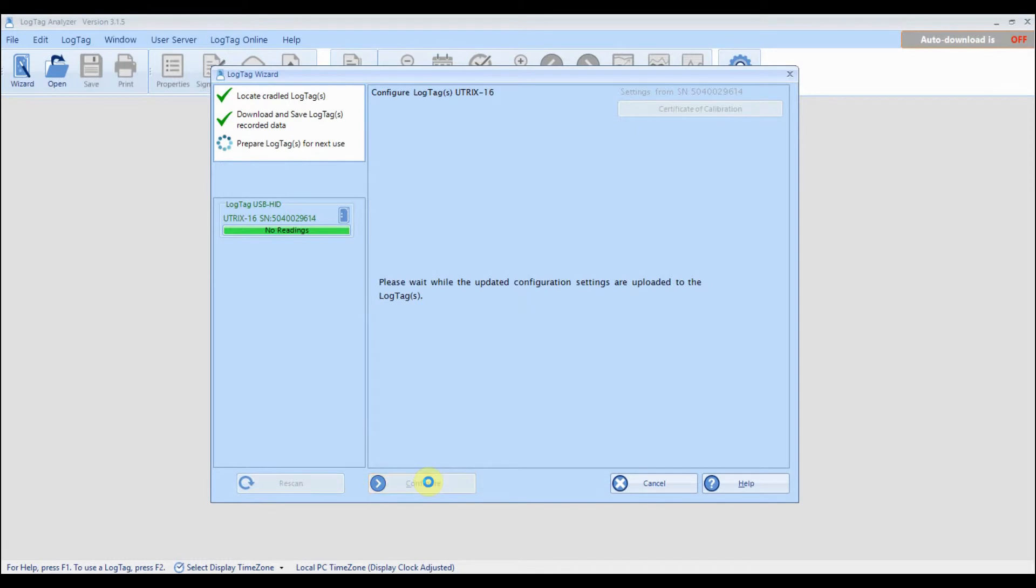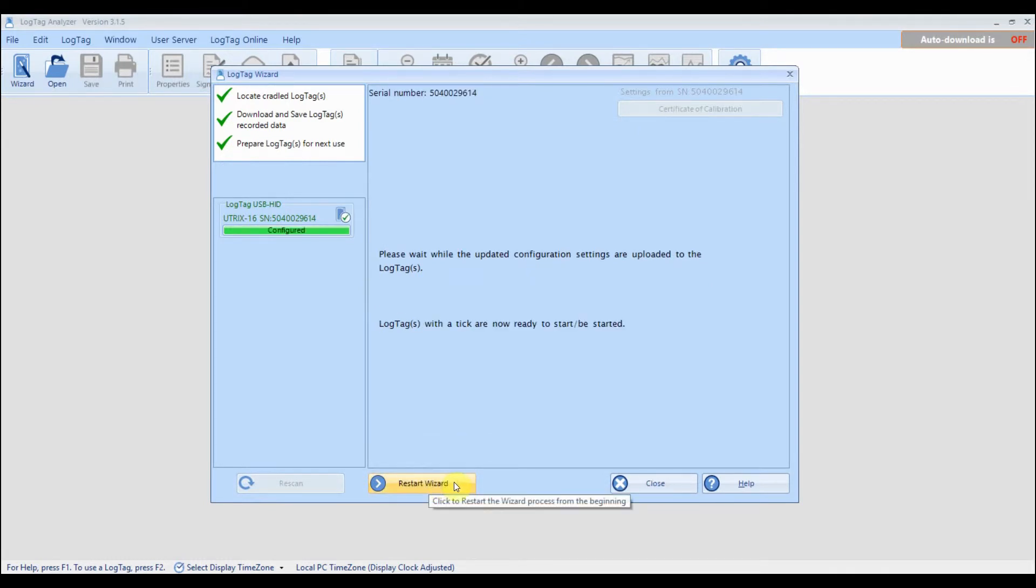Once you are ready, click configure and the wizard will configure your logger with the settings you entered. Once the wizard has finished, you can click close.